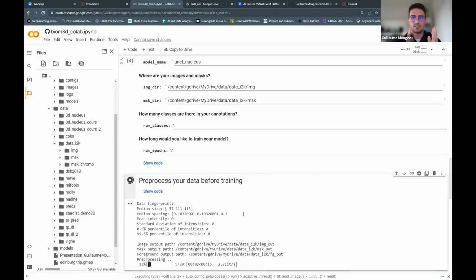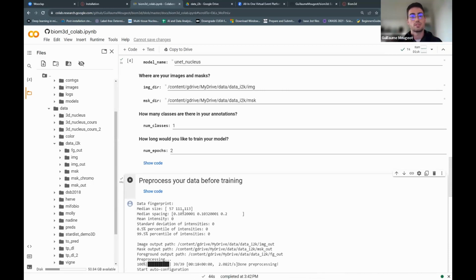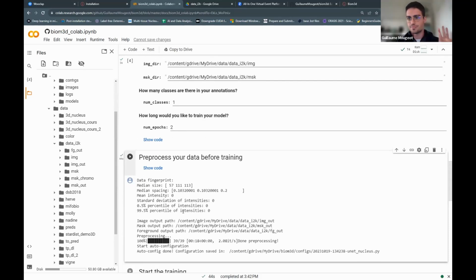And in certain cases you have 3, and in others 2, this piece of code will raise a warning and say, careful, some images have 2, others have 3. Or, for example, if you have in certain cases only 1 label, and in another you have 2, which is actually possible. For example, in our nucleus chromocenter case, we can have images with no chromocenters. And this also gives a warning: some images have only 1 label.